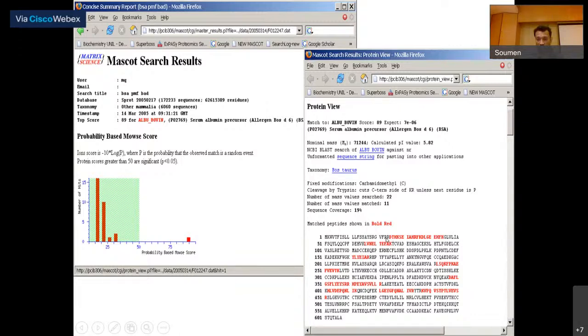Like the first one, it is cut after R, and then between you can see there are more lysines, and many a time we have to remember that there can be one or two missed cut sites, and it may be because of several reasons. It may be because the trypsin was not the best quality trypsin, you didn't incubate it enough, or the protein was not unfolded enough, because it will cut only unfolded protein. So if it is in folded form, then it will not cut.